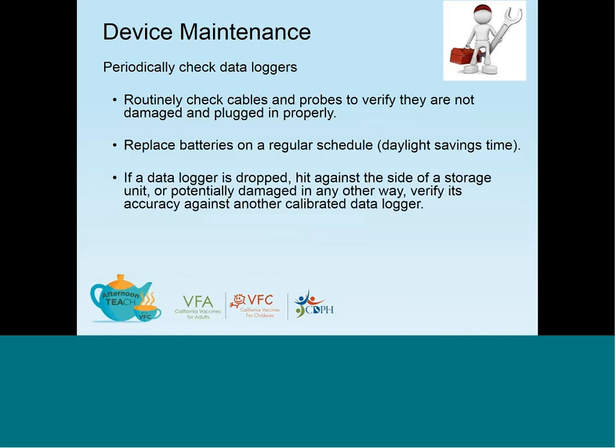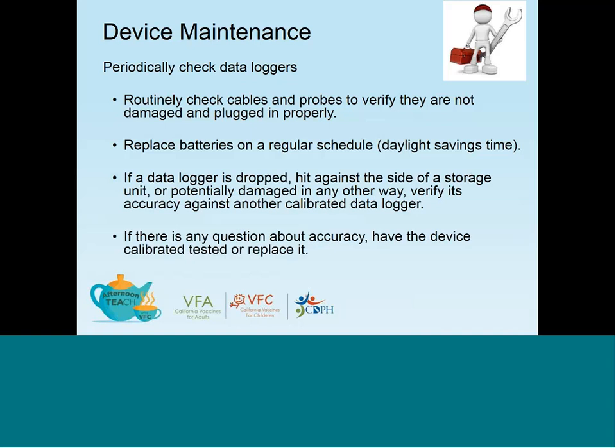If a data logger is dropped, hit against the side of a storage unit, or potentially damaged in any other way, verify its accuracy against another calibrated data logger. If there is any question at all about accuracy, have the device calibration tested or replace it.